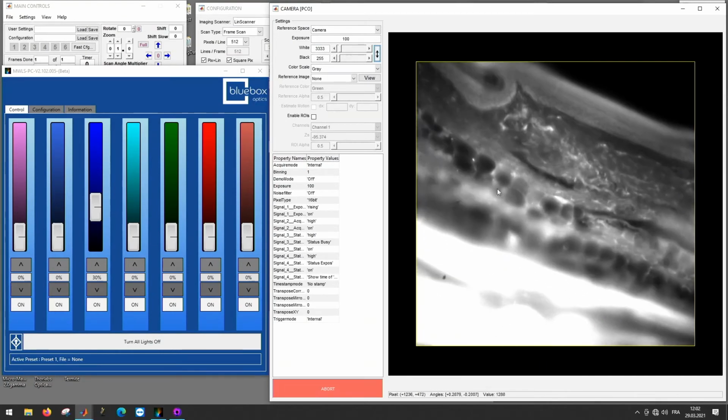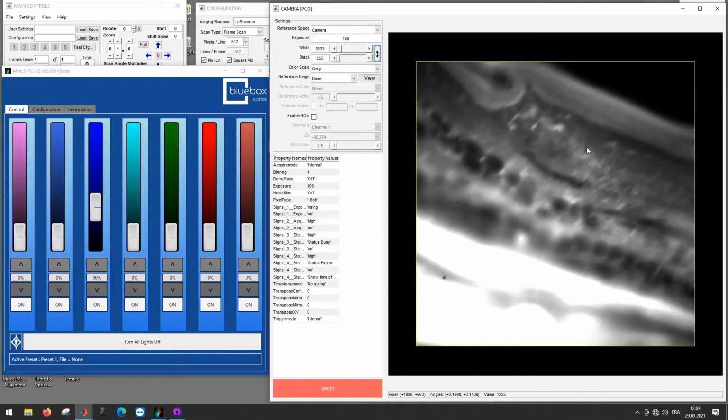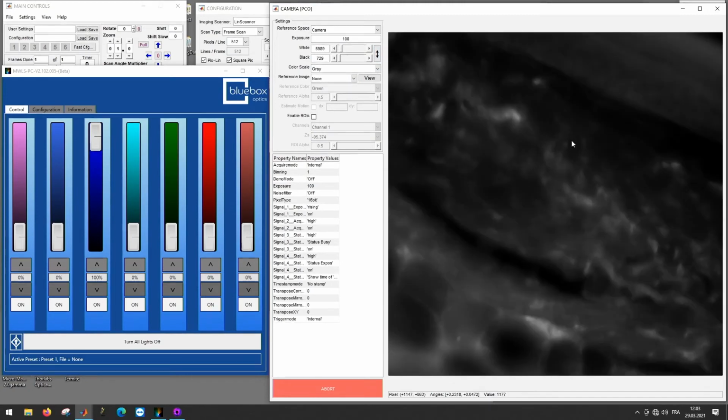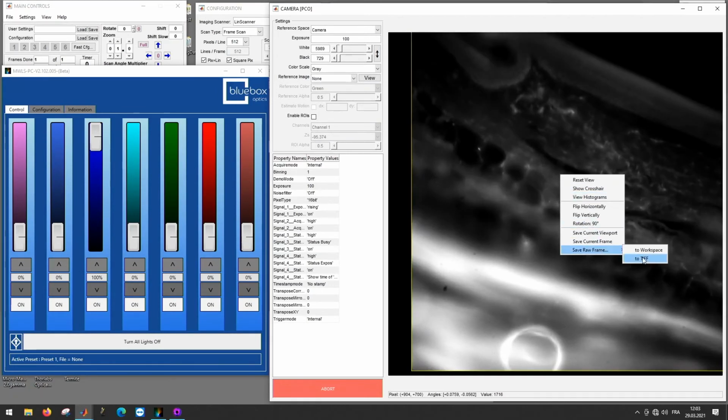And you can see here the molecular structures. Here's the edge of the mouse tail. You have the cellular layer, the skin layer, and of course some muscle and cartilage tissue. I chose a 40 micrometer thick cryosection because we can see some structures in the single photon, but with some background fluorescence, and we can compare the single photon with the multiphoton imaging at this thickness. If you use very thin samples, like 3 micrometers, you have a perfect image, of course, also in the single photon channel. I will just increase the LED intensity a little bit and scroll a little to set the focus perfectly, and I will save the image.